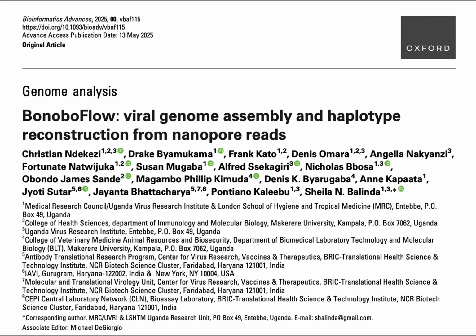Okay, so like trying to piece together a complex jigsaw puzzle where loads of the pieces look almost identical. Exactly that analogy. You could easily end up with gaps or put bits in the wrong place, especially in those repetitive parts of the genome. Precisely. This fragmentation could lead to significant errors during the assembly process. You end up with a skewed view, potentially, of the actual viral genome. It hindered our ability to fully grasp the true genetic variation. That sounds like a really fundamental challenge. But technology moves on, right?